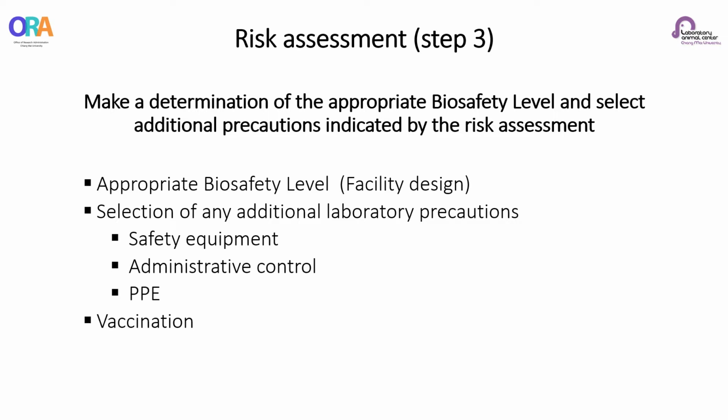The laboratory director and principal investigator or the assignee are responsible for ensuring that the identified controls, such as equipment, administrative controls, or PPE, have been made available and are adhered to or operating properly. Any equipment deficiency should be corrected before starting work with the agent.